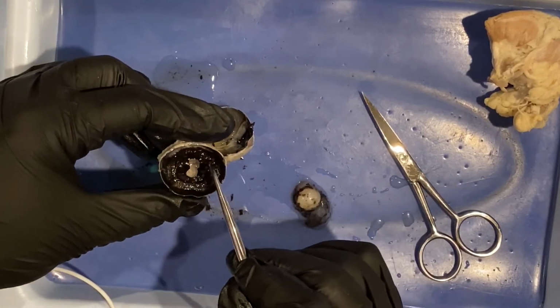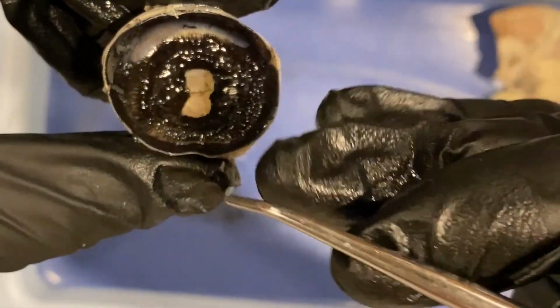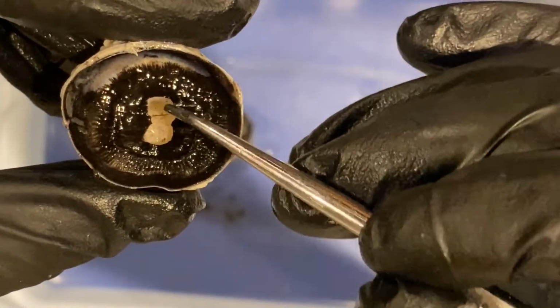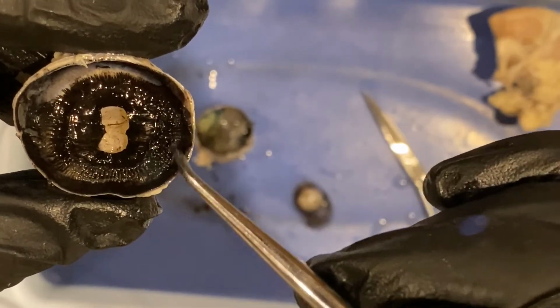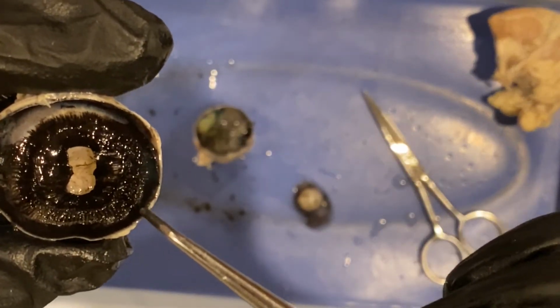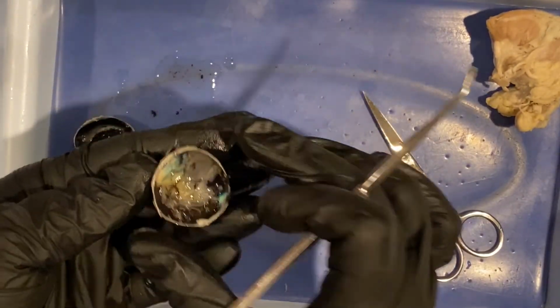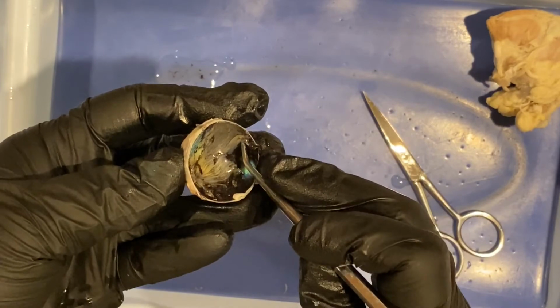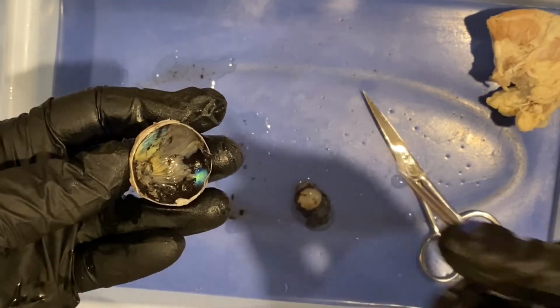Now, you can also see that there are, it's almost like spokes. I'm going to try to bring this closer so you can see it. It reminds me of a bike wheel with the spokes going towards the middle, but that is indicating the ciliary muscle, right? Now, the dark color that you're seeing on both the anterior and posterior sections I have, this is part of the vascular tunic, and that dark color, when it continues to the posterior portion of the eye, that is called choroid. The dark color actually helps to absorb the extra light that enters the eye that isn't actually used by the retina.